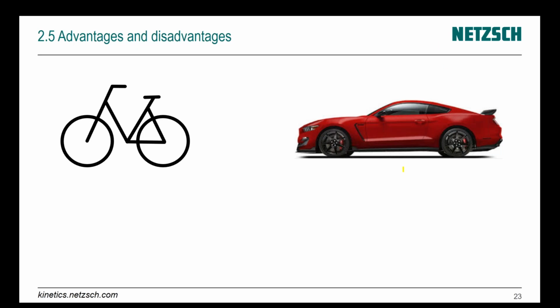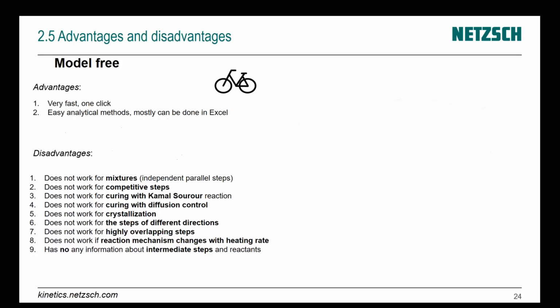In this case, it works, has no problem with distance, has no problem with hills, but it requires learning. Usually, it is not very hard to learn to drive, but you must learn it. And if somebody drives the car in the wrong direction and has an accident, then it's not a problem of the car, but the problem of the driver. And if somebody has a curve with 2 peaks and tries to make 8 reaction steps for each and fails, then it's not a problem of the method, but the problem of the person.